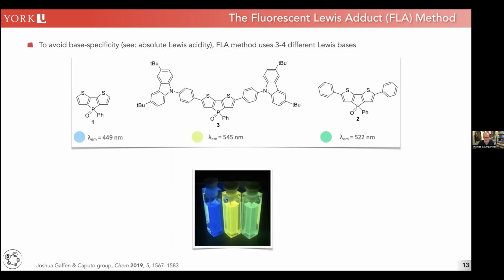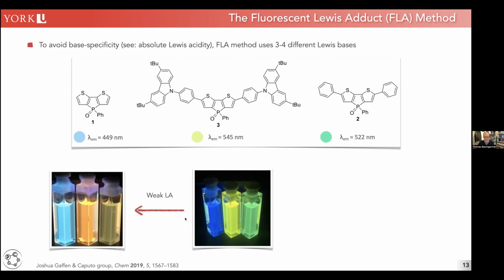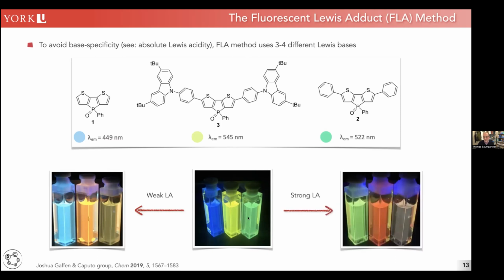So here's just the pure Lewis bases, the probes. We have the blue one on the left, the yellow one in the middle, and the green one on the right. We coordinate weak Lewis acids. You can see that the color changes are as such that, again, the dark blue becomes light blue, the yellow becomes orange, and the green becomes sort of this greenish yellow. When we add a strong Lewis acid, the blue becomes green, the yellow becomes red, and the green becomes sort of this yellow orange here. So again, we're moving along the optical spectrum from blue to red, the stronger the Lewis acid is. And ultimately, we have a starting point, and then we have a delta to the Lewis acid adduct.